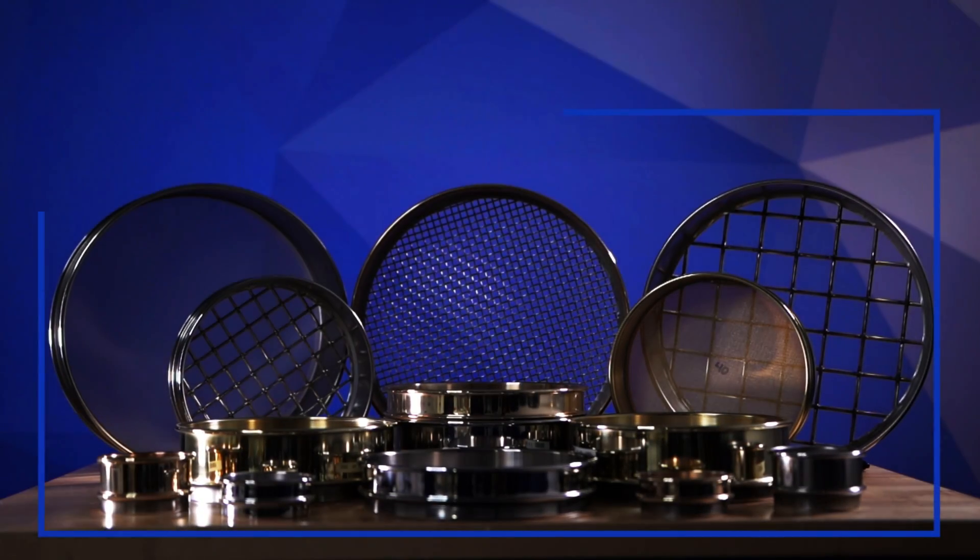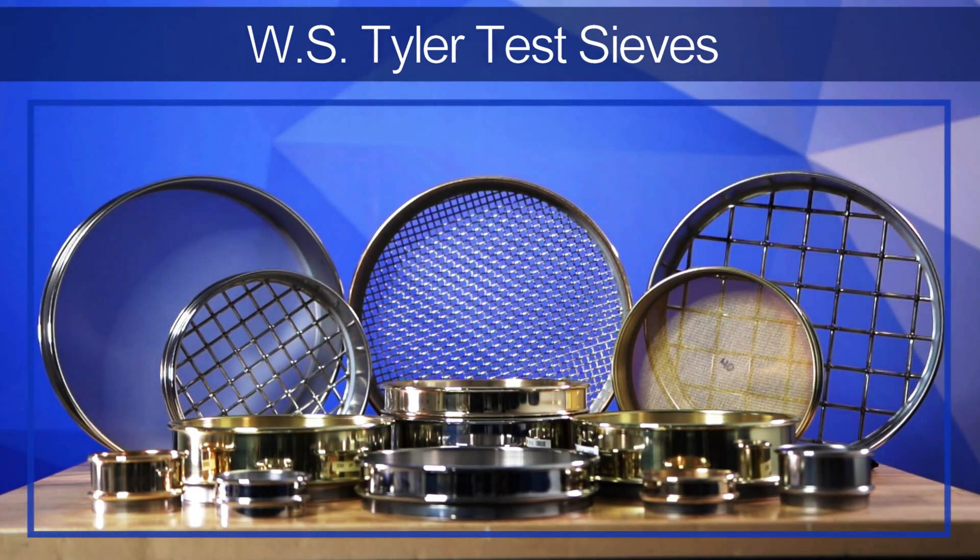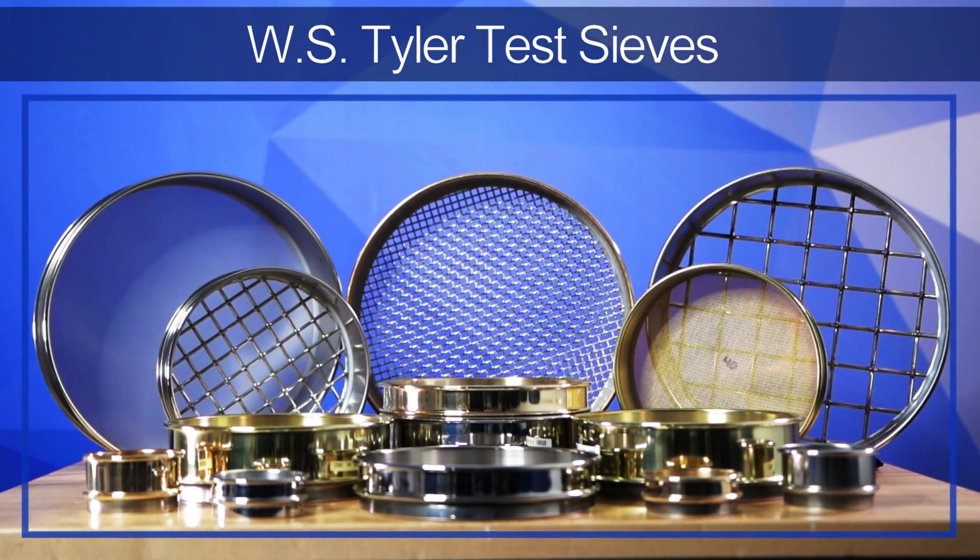I'm here to tell you the differences between brass sieves and stainless steel sieves. WS Tyler has been a prominent manufacturer of particle size analysis equipment for over 150 years, and we strive to help customers know everything they need to know to make the best choices in their filtration endeavors.